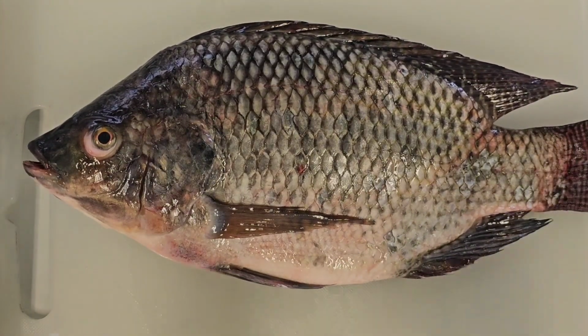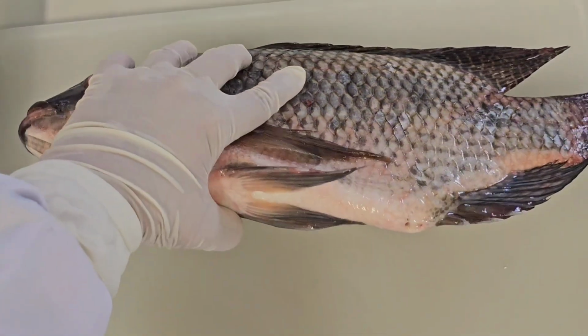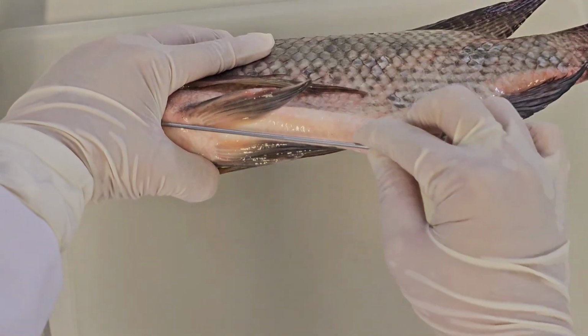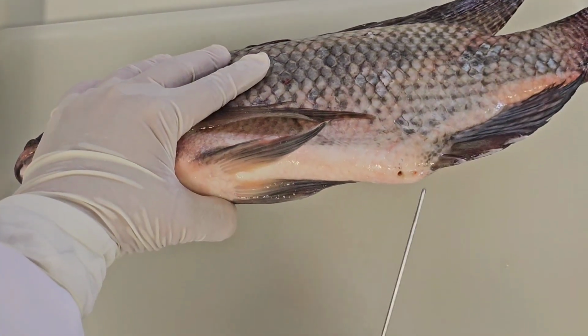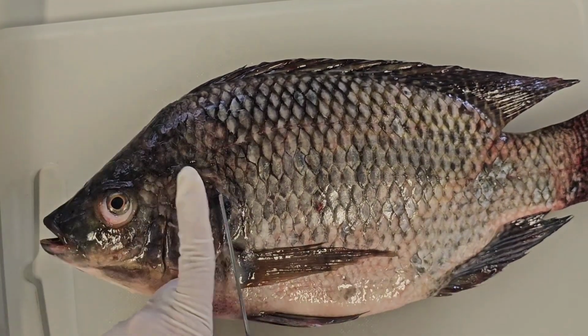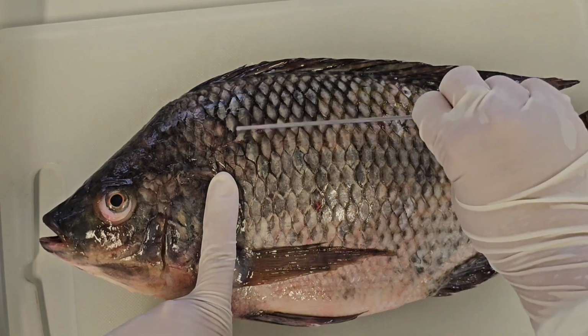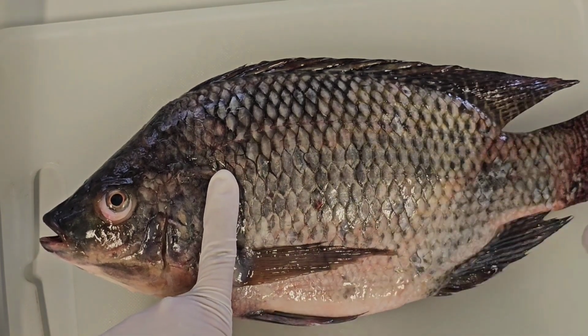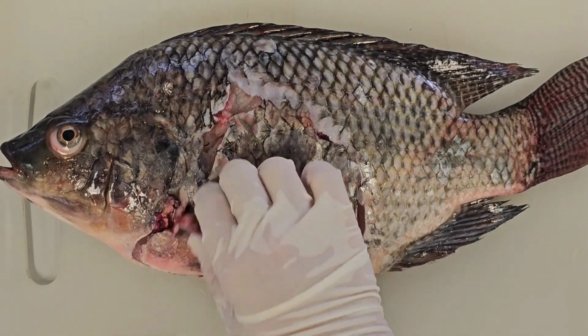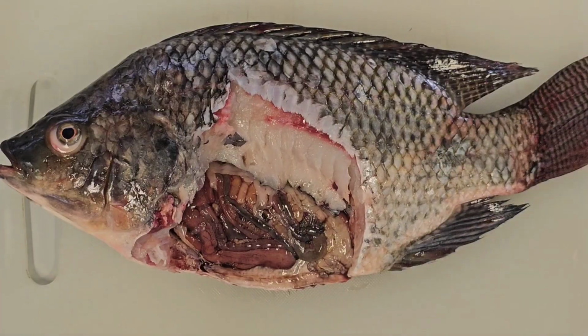For the next part, I will cut through the body of the fish to see the anatomy inside. First, I will cut from the anus going to the pelvic fin, and then cut from the anus going to the dorsal fin, and I will cut it to be like a rectangle, and I will open it. After I finish cutting, I will open it so you can see the abdominal cavity inside.